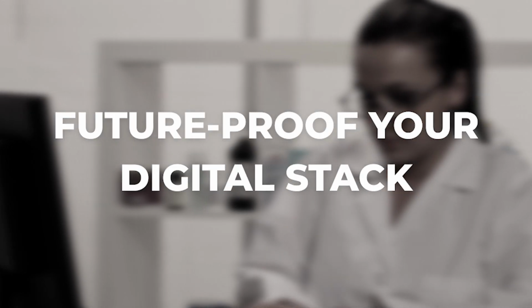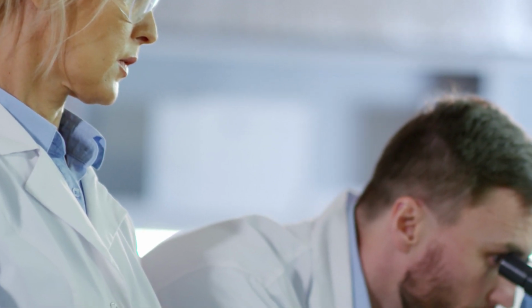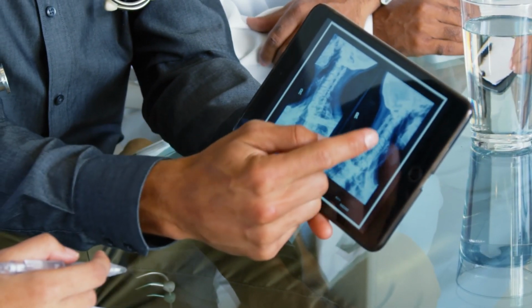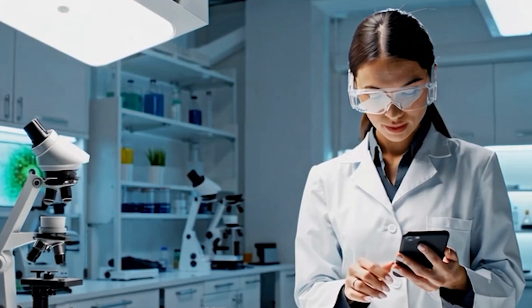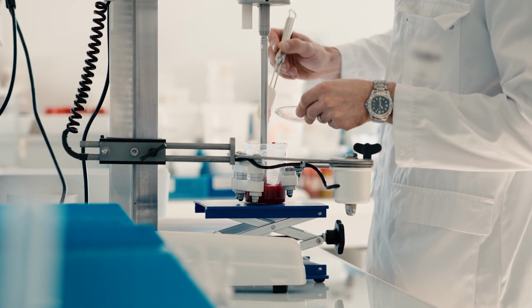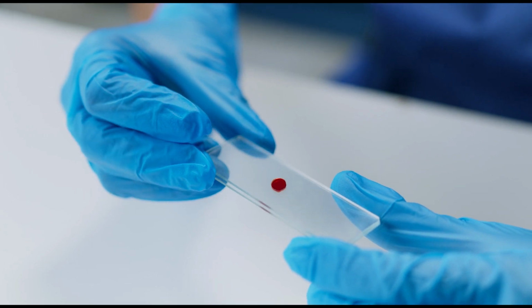5. Future-proof your digital stack. Digital pathology is just the beginning. Don't get locked into a system that can't evolve. Your LIS should support modular architecture, allowing you to expand into areas like AI-driven diagnostics, remote consultations, multi-site operations, and genomics without a major system overhaul. This isn't just about today's needs. It's about setting up your lab to adapt to tomorrow's technology without breaking what works.